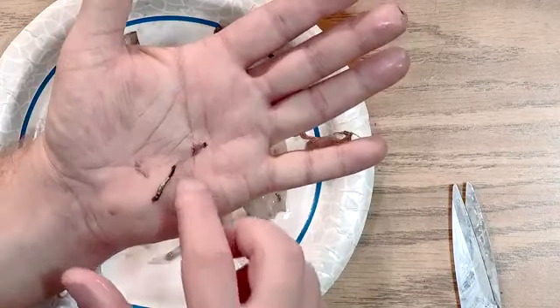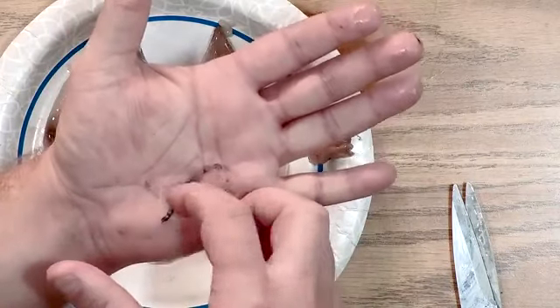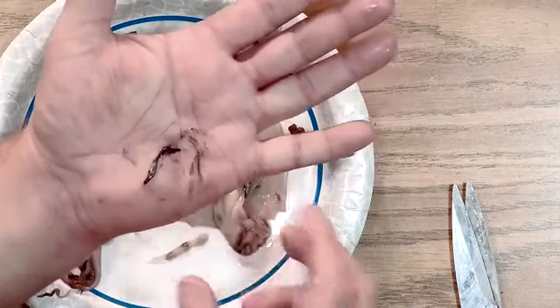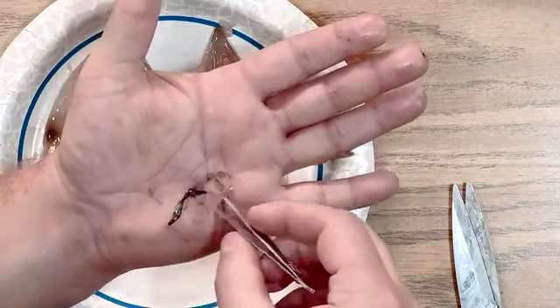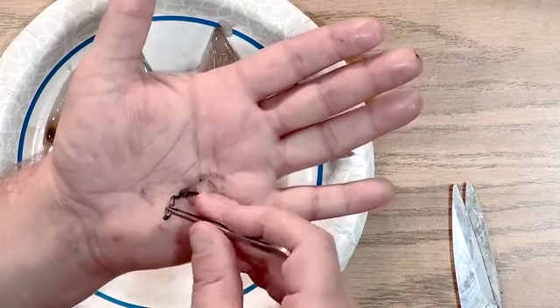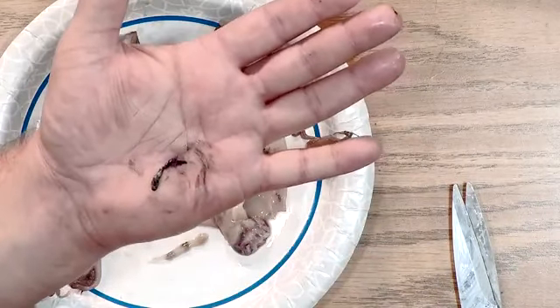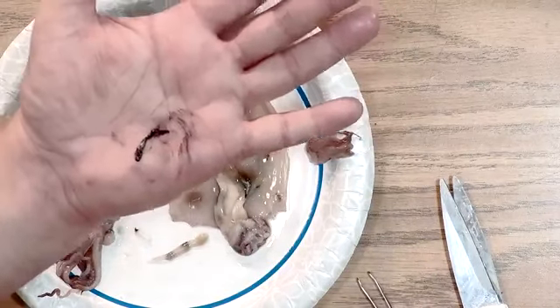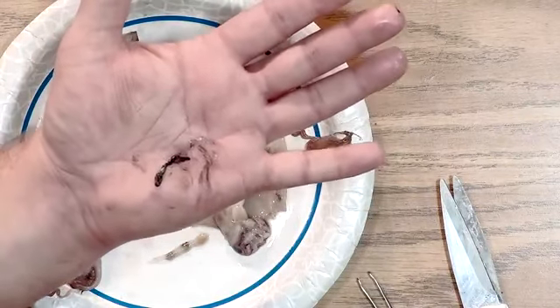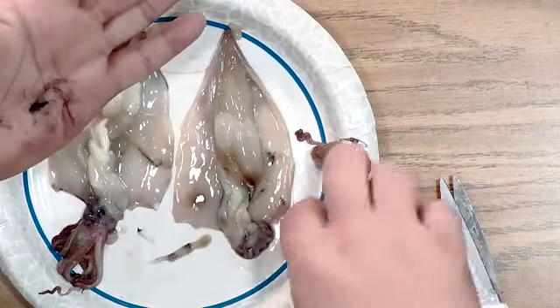Now, as I smashed it, there's a little bit of a break there, and now you can start to see black on my hand. That's because this is actually ink. If I took a pin tip and I poked into the main part of this and got some of that ink on my tweezers or a tip, I could actually write my name on a piece of paper with this. Now imagine how much ink you could get out of a large squid. So that's another pretty cool thing going on here that you're not going to find in very many other animals.